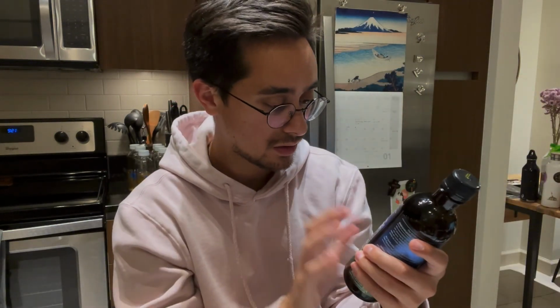So for the 12 ounce bottle to say that there's 16 grams of sugar, that's probably the highest proportion of sugar of all the bottles that I've seen here. So it's labeled high and it actually tests high.